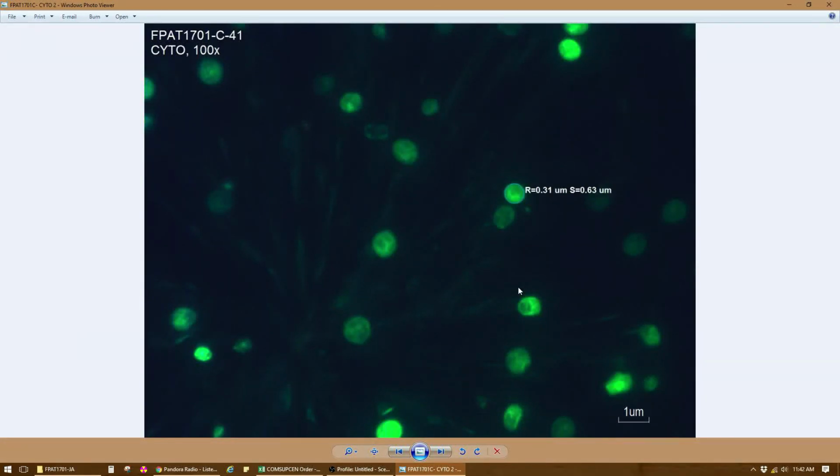I also think it's good to not take your sample information summaries from a single image. I think it's good to make several preparations from the same sample, and then really look at it in a lot of different ways to make sure that when you report about that sample that it is actually representative.